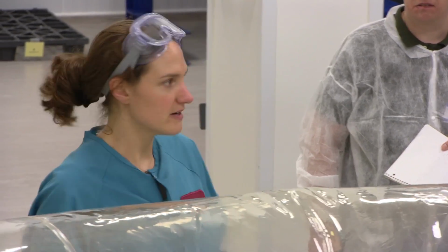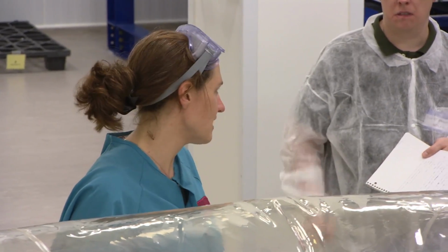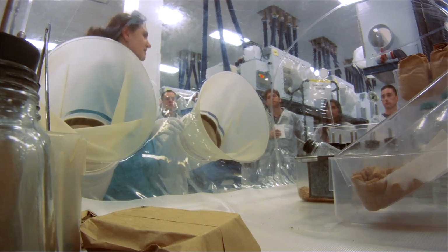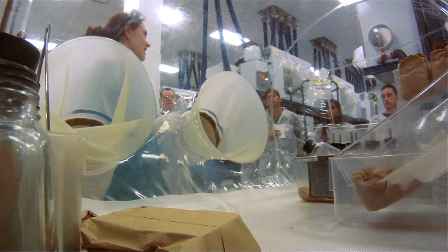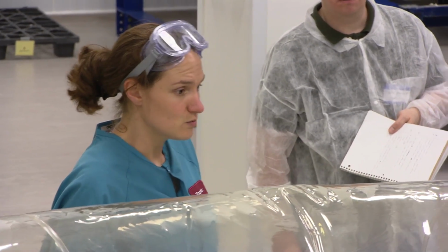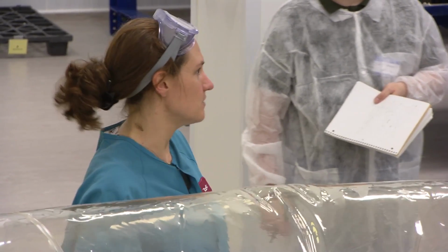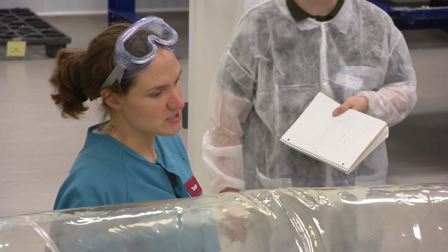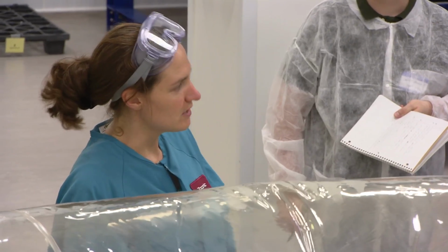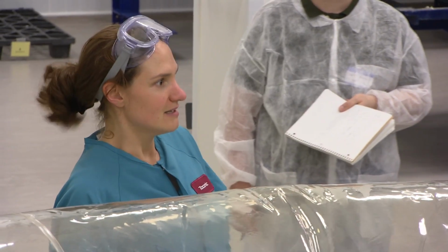Now again, if the animals are in here, we'll usually place the isolators on what we call a 3-week detainment. So usually there won't be any sales or shipments out of the isolator for a period of 3 weeks, so we can determine if it has picked up any contaminants. Once the isolator is clear with a seam split or even a hole in the glove, transfer into a new isolator. Seam splits especially, it seems like once they get started, they just want to keep going. So reinforce with the yellow tape, and then once you know you're clear, no new contaminants, get into a new isolator.